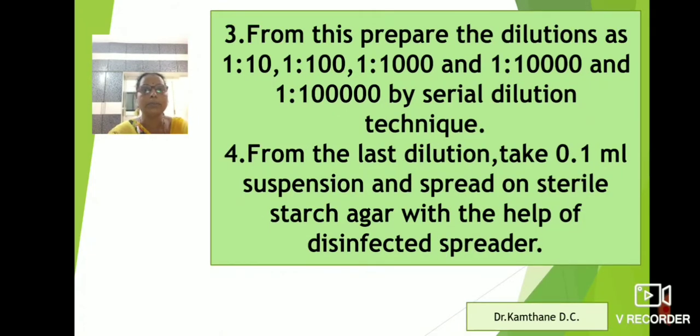From this prepare the dilutions as 1:10, 1:100, 1:1000, 1:10000 and last 1:100000 by serial dilution technique.